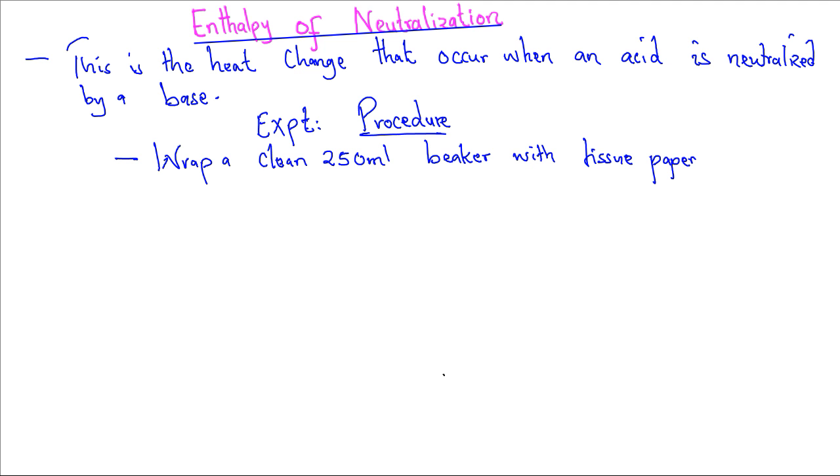Transfer accurately 50 cubic centimeters of 2 molar HCl into the beaker and note its temperature as T1.